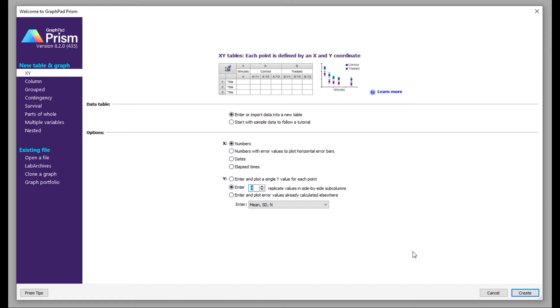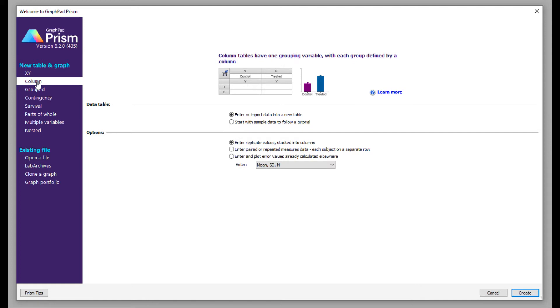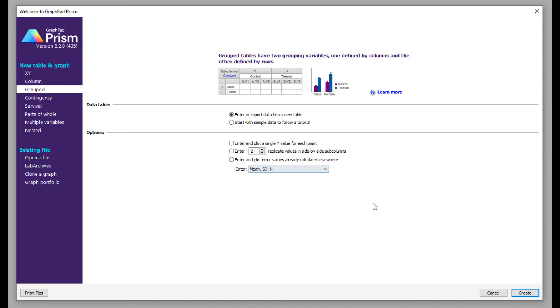Then you have column, which is very similar to the XY coordinate. You can plot your data in the form of columns. Column tables have one grouping variable with each group defined by a column, so if you want to plot your data in column form you can use this setting.